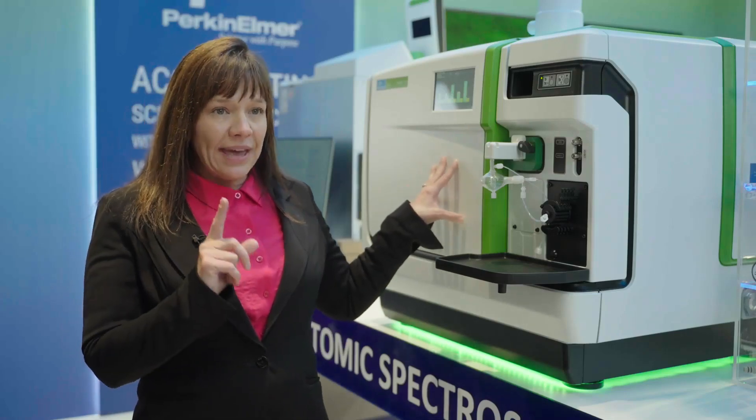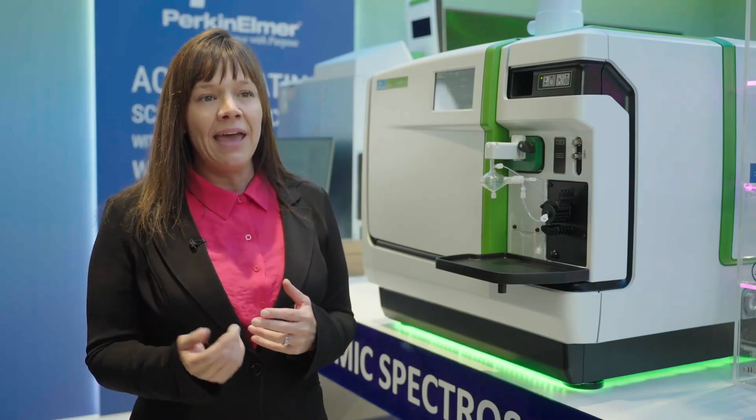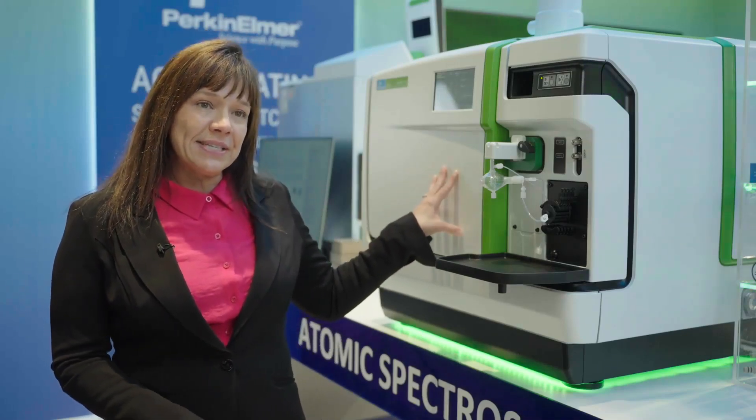Even though it has only one gas channel to begin with, if later on you realize that you have different needs in your laboratory and need more reaction capability, at that point we can upgrade this system to either a two or three gas channel system.